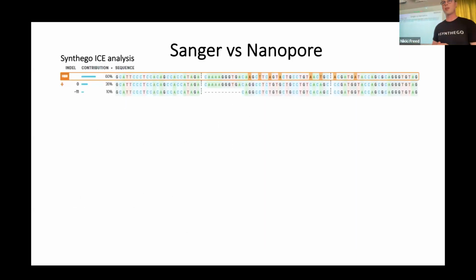So here's an example. There are Sanger sequencing software available that can analyze gene edits. These are great for gene knockouts. This is an example for an edited sample where it's reporting 60% of our alleles have homology-directed repair. So we're like, amazing, this is an awesome result. 60% of the alleles have the edit we want them to have. The other 2 alleles are the wild type and the mutant allele. So there's very little going on.